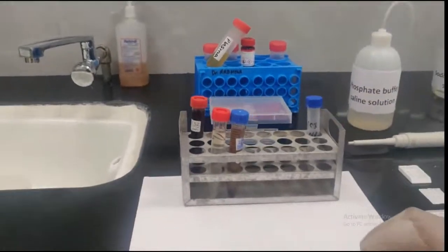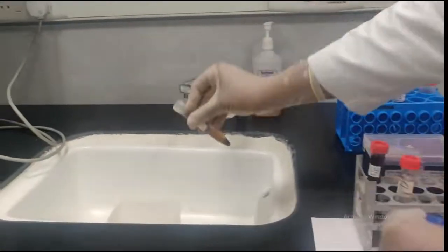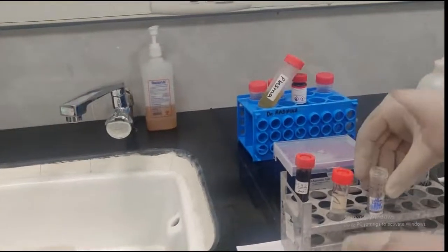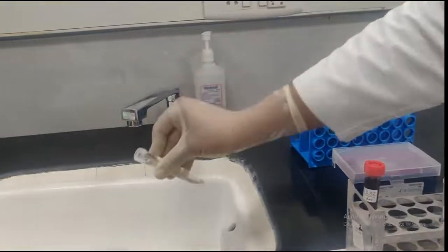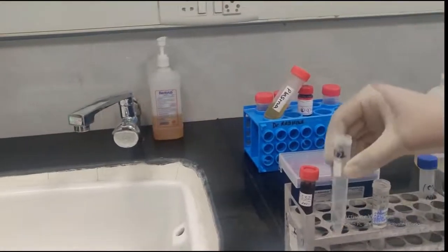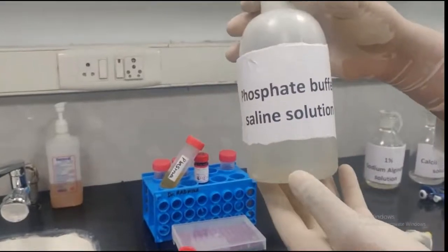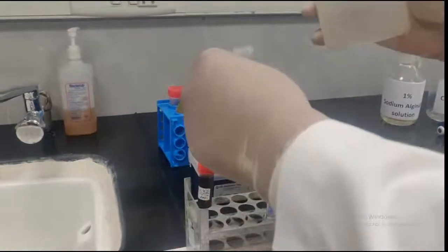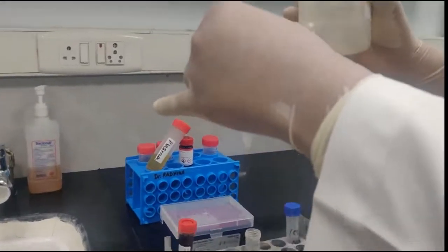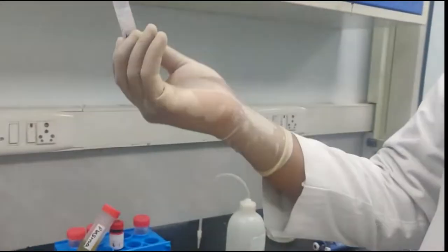So now we have to do the washing step. The supernatant has to be discarded. Similarly, for the next sample, the supernatant will be discarded. So for the next step, that is washing, we will add phosphate buffered saline. So now this will be added to the falcon tubes with the cell pellet at the bottom. These are being capped.